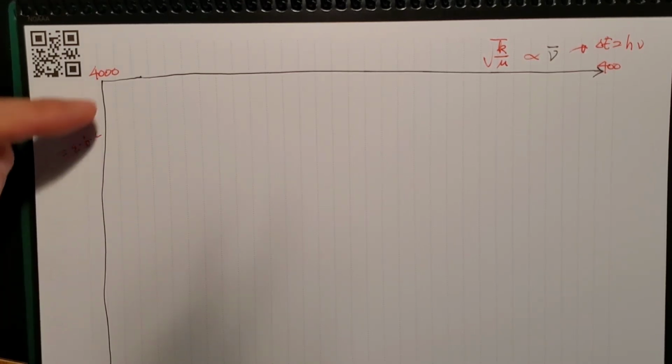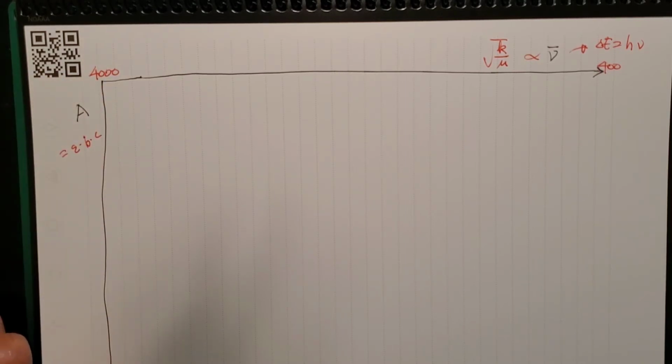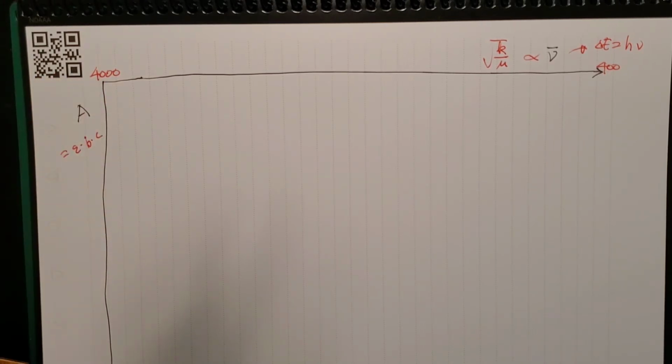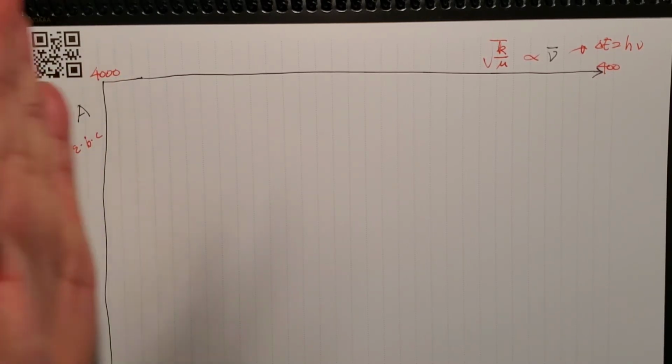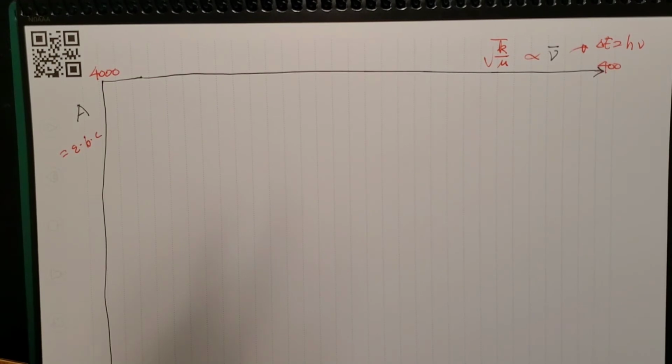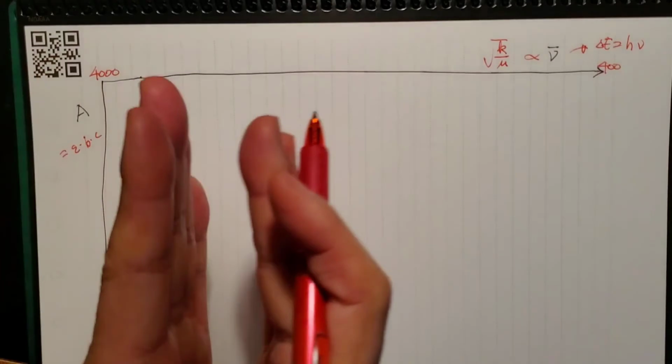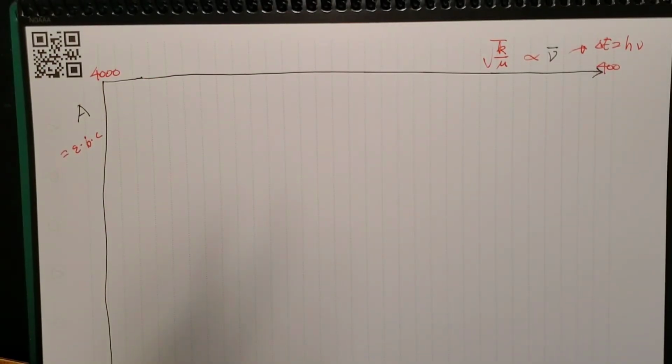The polar one is going to give you a stronger intensity of signal, and the weaker polar functional group gives a smaller size. So you need to keep track of the size and also location. And then there is the factor of fatness, how broad it is, how sharp it is. And that is due to the intermolecular interactions or the environment that the molecule is in, or solvent and things like that.